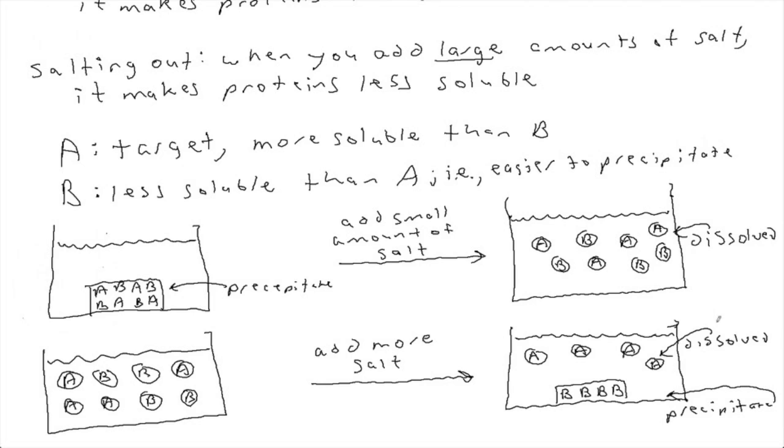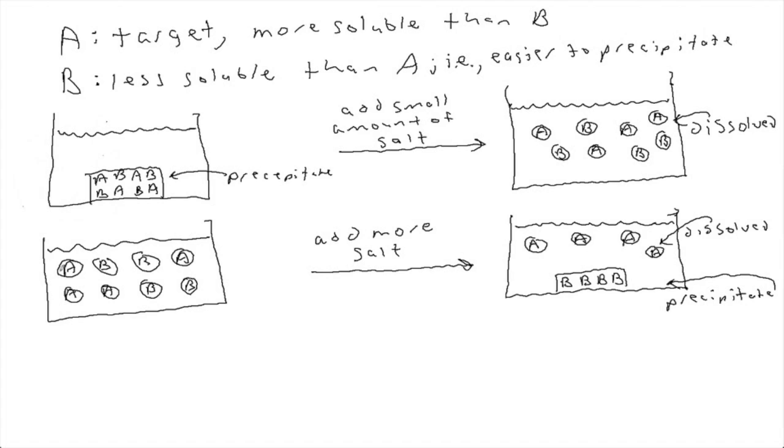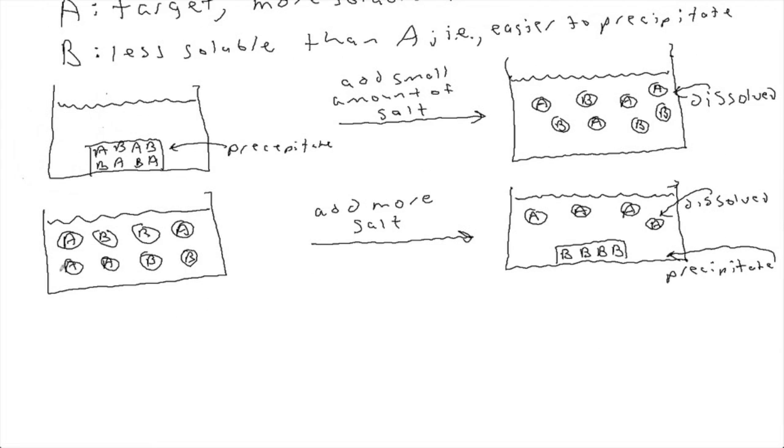Okay, so have we achieved separation? Yes. Yeah, pretty much. All we have to do now is carefully pour the liquid off of the precipitate. Now that it's easy to remove the liquid portion from the solid portion, just carefully pour off the liquid portion, and then we have those separated. Actually, I should say here.